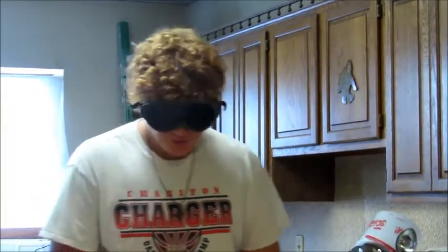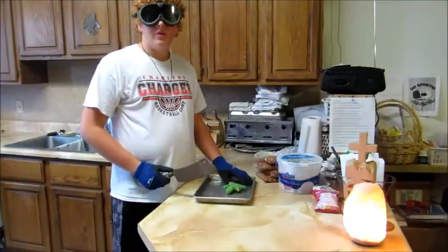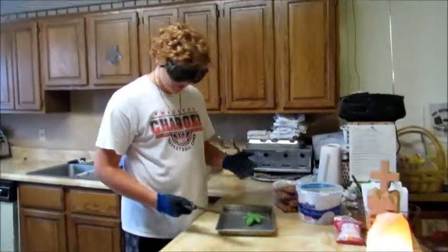Always wear your goggles in the safety environment. Who needs goggles? Always dissect your specimen in a dissecting tray and wear gloves. It makes it a lot safer.